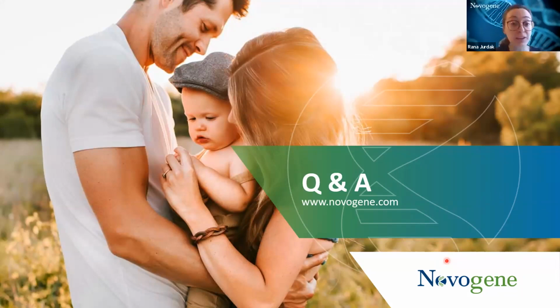So I will start with the first one from Irina, who is asking, how many samples are considered sufficient for differential gene expression analysis in a treatment trial with certain chemicals? She means by that treated and control groups. So usually we would recommend 3 to start. If you are aware that the variability of your sample is huge, then we recommend increasing it to 5. But usually 3 is a good starting point. So 3 per condition. Yes, 3 replicates per condition.